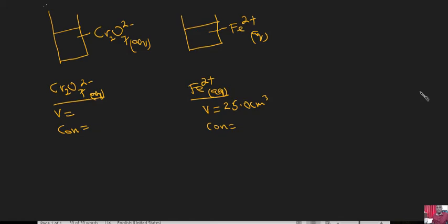Then the concentration of iron 2 was 0.048 M, while the concentration of dichromate 6 was 0.01563 M. After titrating, we have found that the solution of dichromate 6, which reacted with iron 2, that is the solution that we ran out of the burette into the conical flask for the reaction to take place, at the end point was 13.0 centimeters cubed.